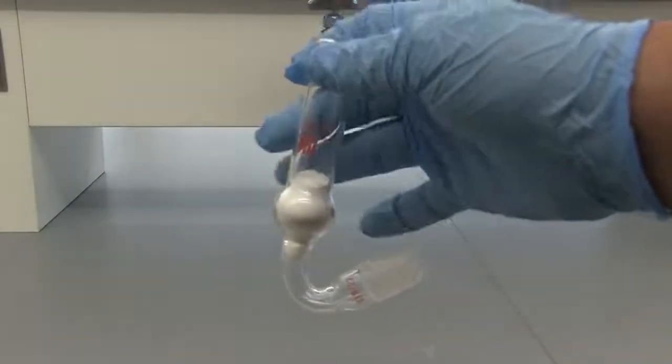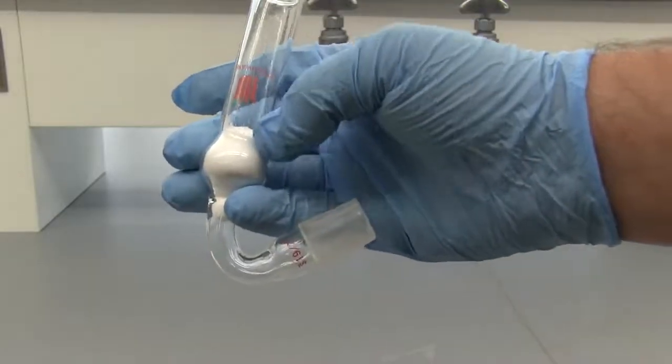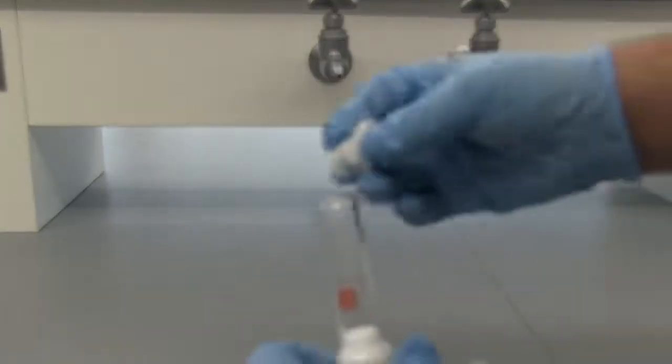All right, so we've got our calcium chloride powder in there. If you have the granulated, I'd fill it to about here or so. But since we have the powder, I'm just going to fill it to here. And now we'll take another piece of cotton and plug the top.